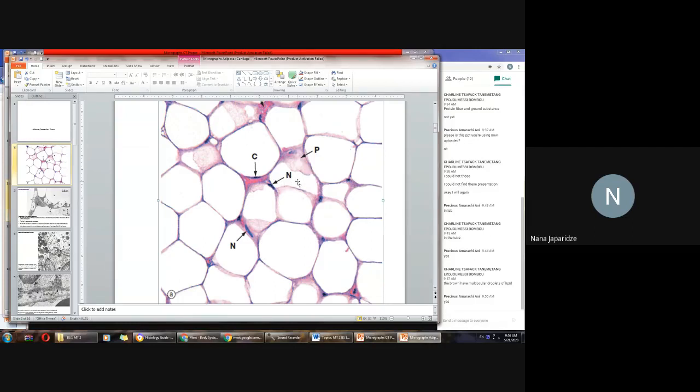Is it understandable what I say? So why you see here much more cytoplasm, this is due to the plane of section, which goes through this surface of the cell, which is covered with the cytoplasm. Okay? Is it understandable? Through these parts. So you know that the cell is a three-dimensional structure.